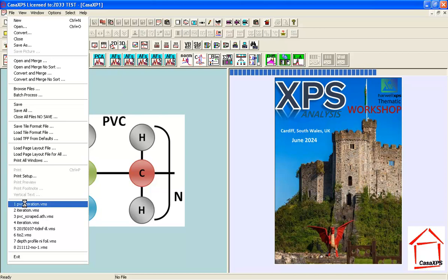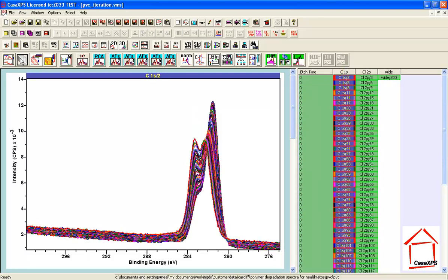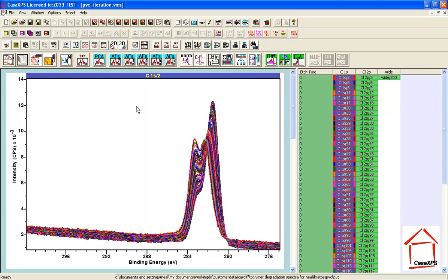collected from PVC. So we expect to see carbon and chlorine in the data, and the data file consists of carbon and chlorine VAMAS blocks representing narrow scan spectra for each one of these element transition fields, hence they appear as two columns in the VAMAS file. There is a survey measurement that is actually measured at the end of the sequence, but the evolution or the changes that I would like to analyze using this toolbar are clear within the carbon for sure, and there is some kind of movement that we see in the chlorine. But of particular interest is what happens in the carbon.